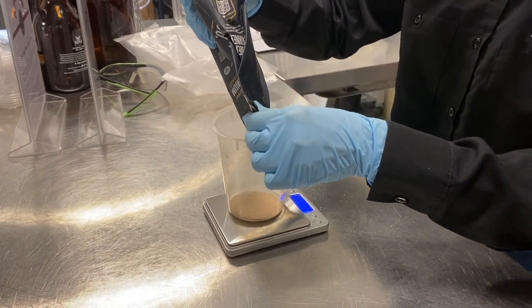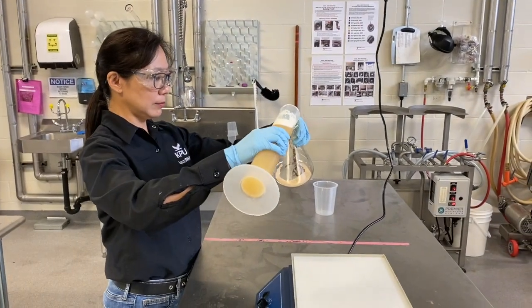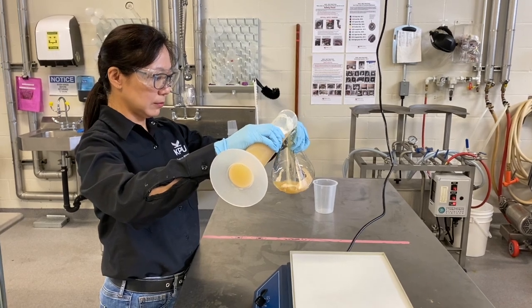Instead of a yeast slurry, you can also use 10 grams of dry yeast and add it to 500 milliliters of the wort.